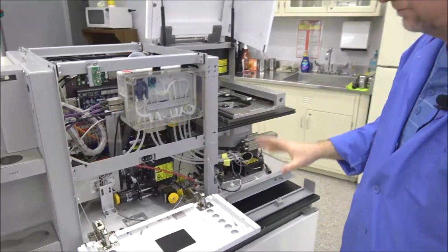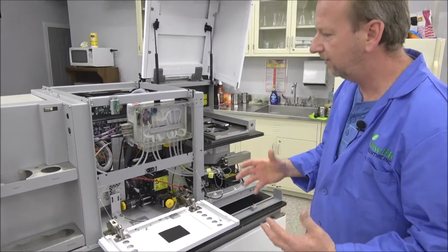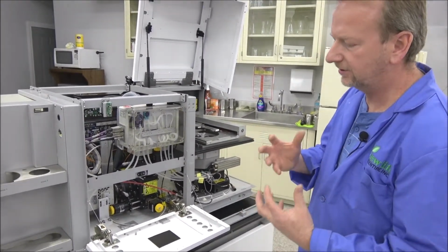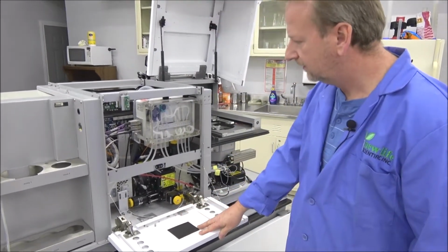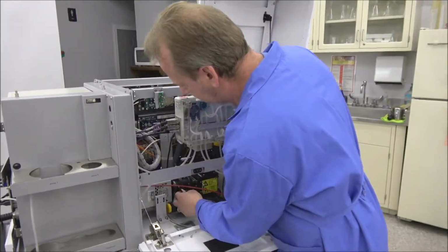It should have probably stayed fine. The software does take into account a little bit. If they're off just a little bit, the software does actually match them up pretty good anyways. But anyways, that's about it on the, well, no, I'm sorry, I was going to show you what you've got to do to make the adjustments.